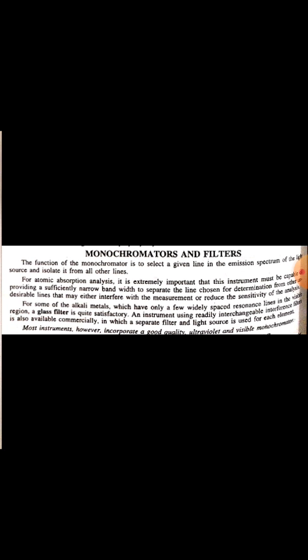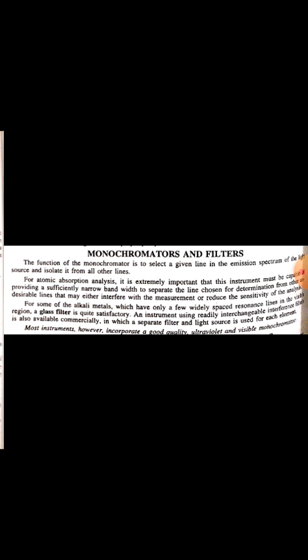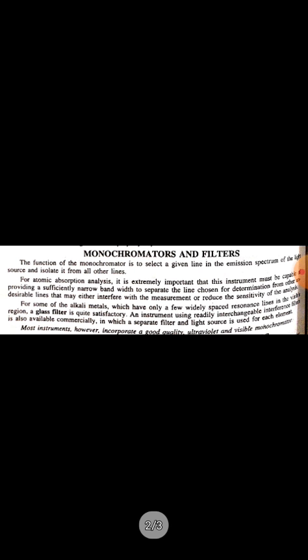Burners are the next component of the instrument. The total consumption burner and the pre-mixed burner are used in the atomic absorption spectrometer. In the pre-mix burner, the sample is aspirated into a large chamber by a stream of oxidant, where a fine mist of sample, the oxidant and fuel supply are mixed and then forced to the burner openings. Large droplets accumulate in the bottom of the chamber from where they are drained off.